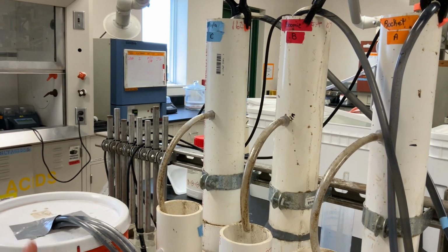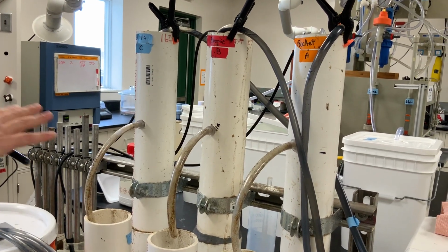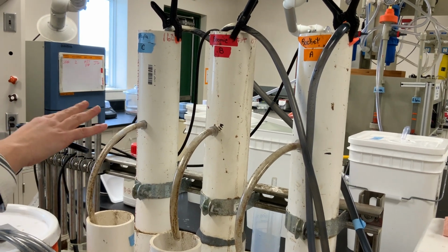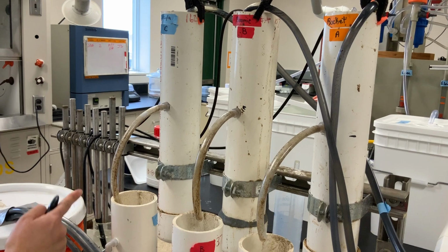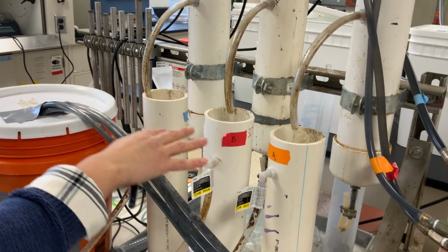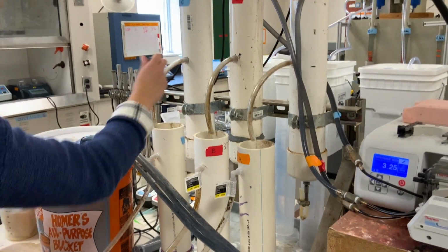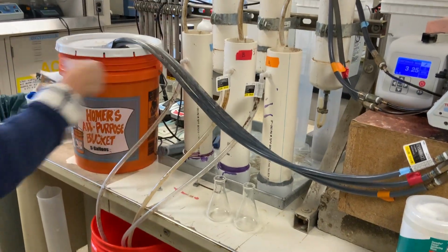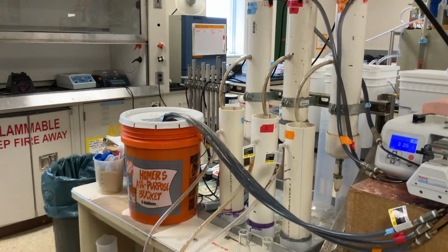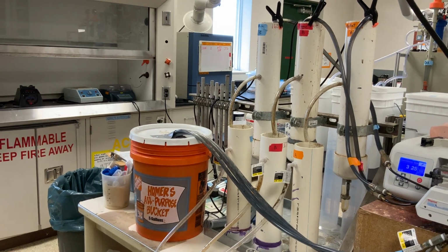Right now we're working with a 16-hour hydraulic retention time, so the amount of time that the sewage sits inside this aeration chamber. From there, the overflow drips down into these tanks at the bottom. These are settling tanks. I collect effluent from the top, and the extra sludge settles to the bottom and is then recycled every day. So this is a continuous process, not a batch type.